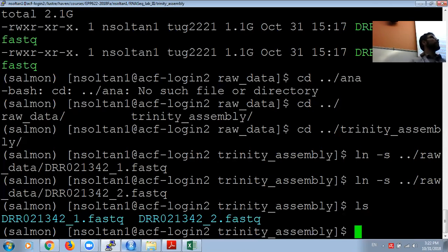The min contig length is 51, meaning 50 nucleotides. It means that the assembler will remove the reads that have less than 50 nucleotides and give us the ones that are higher than this. And Jaccard clip, no salmon, and Trimmomatic are three other options that are used for removing the adapter and handling the reads that have overlap of 3' UTR.